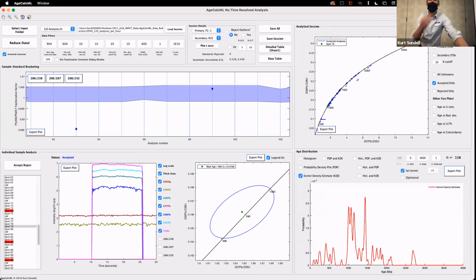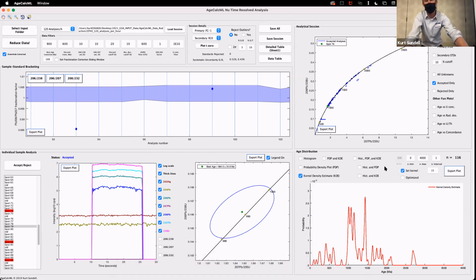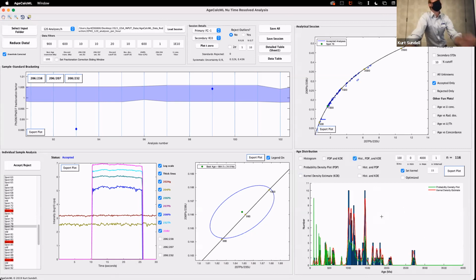And so the idea is just to visualize your data the best you can, right? So there's no hard and tried and true cookbook on doing this. These are just decisions you have to make. Sometimes a cumulative plot I find to be even really useful. So the cumulative distribution functions, those are really nice, which I don't have coded into this right now. So by default, I just have everything plotted up, because even an old school histogram, nothing wrong with that, right? You're just trying to figure out which populations you have and which you don't. Most questions in detrital geochronology are about presence and absence. These quantitative tools that I'll talk about in a little bit, they're really for more nuanced questions.